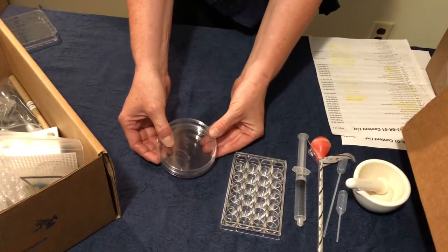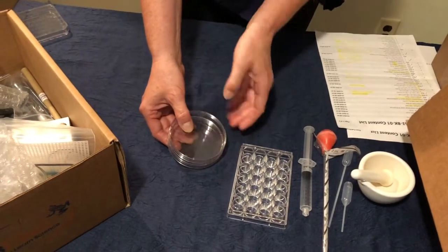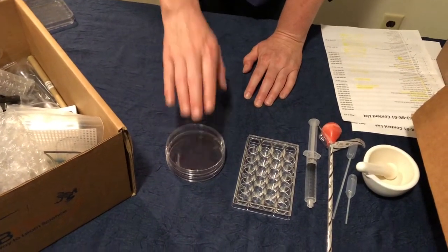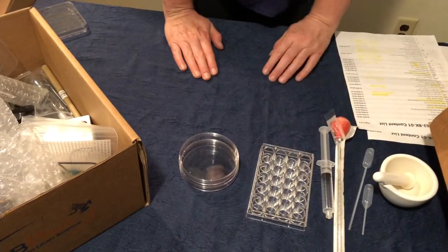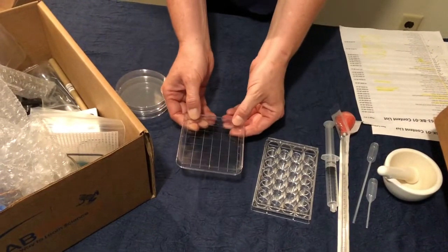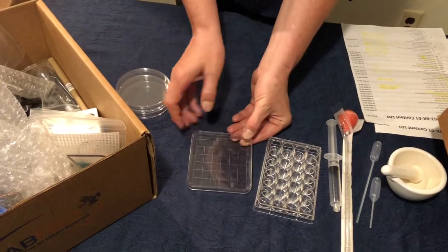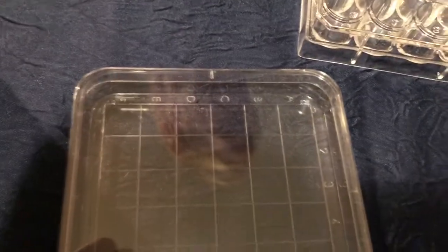We have our round petri dishes. When your round petri dishes come, please keep them in the package — you can feel the rounded edges through the packaging. Please keep them sealed until we're ready to use them. The goal of keeping these sealed, and keeping the pipette tip sealed as well, is that we want to keep things sterile as long as possible. This is our square petri dish, and inside it you can see a nice grid that will be useful and helpful when we get to that portion of our experiment.